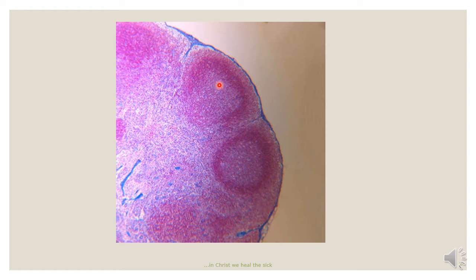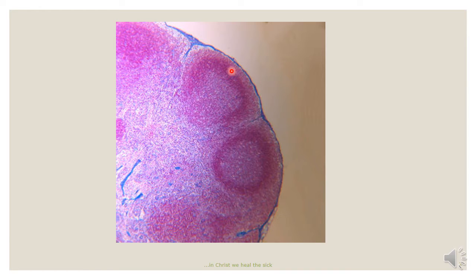Beneath this capsule is a narrow space called the subcapsular sinus. As you can see, under this blue capsule, there is a narrow whitish space, and this space is called the subcapsular sinus, into which the afferent lymphatic vessels drain. From this subcapsular sinus, channels called the cortical sinuses pass towards the medulla through the cortical cell mass.